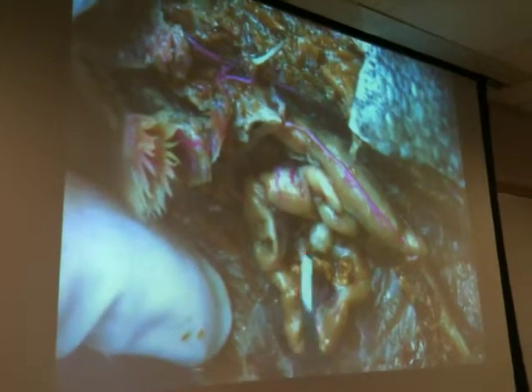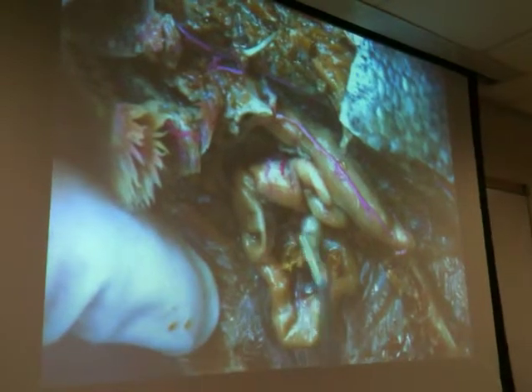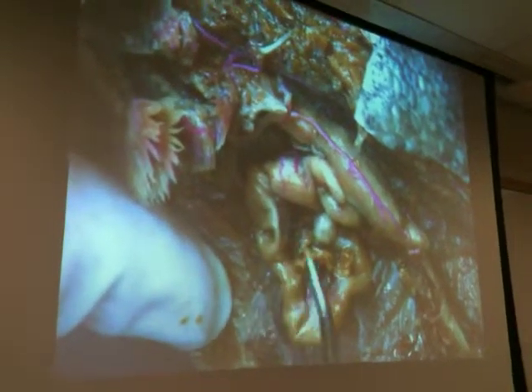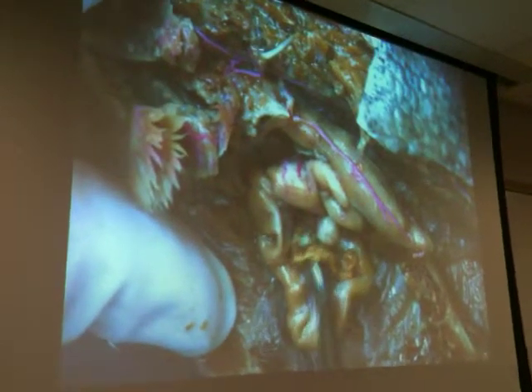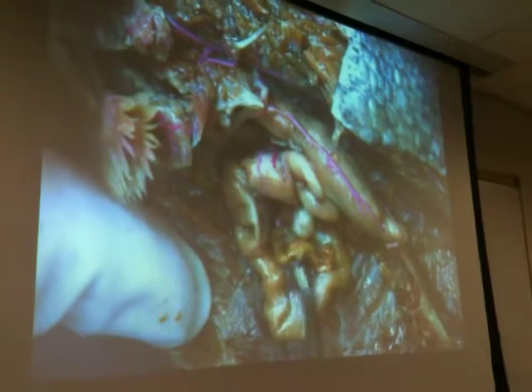On yours, it will look less mutilated, and it will be tighter and closer together. There'll be more mesentery. Okay, but in the duodenum, in that first fold of the intestine, you'll find the pancreas. Let's look for that. What else?